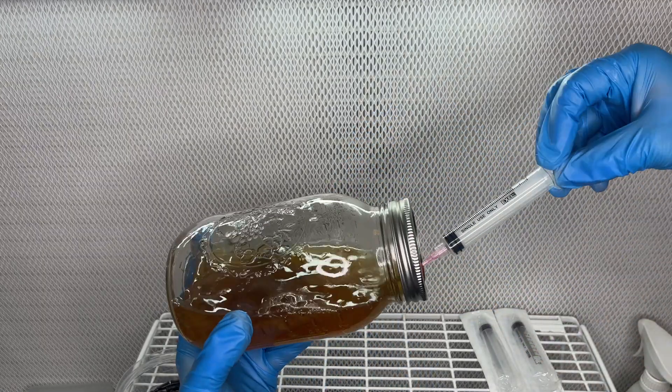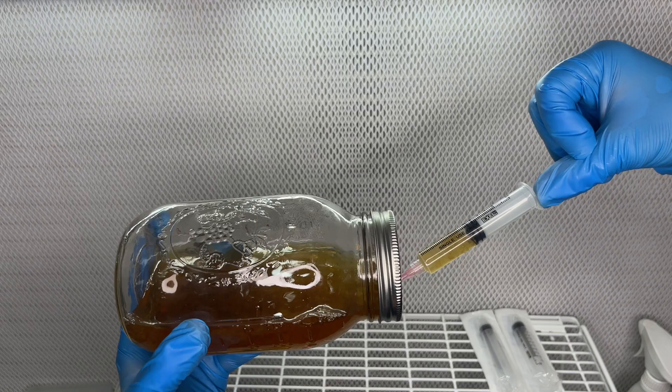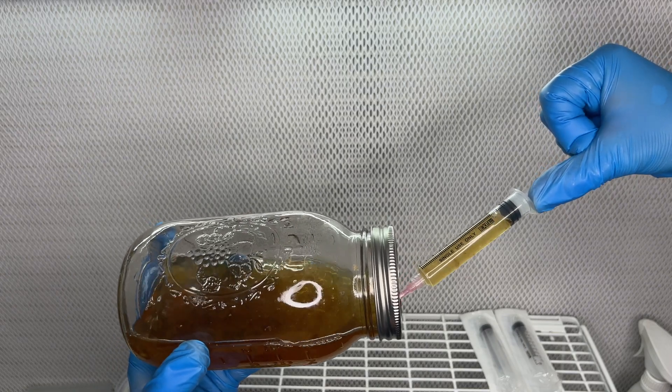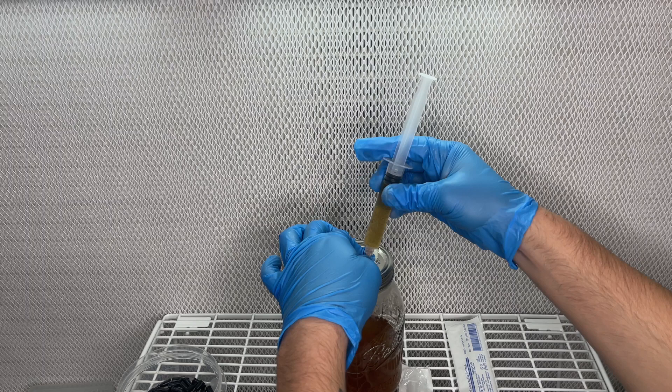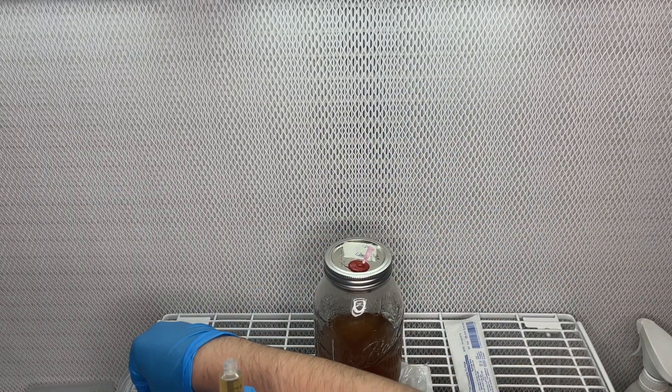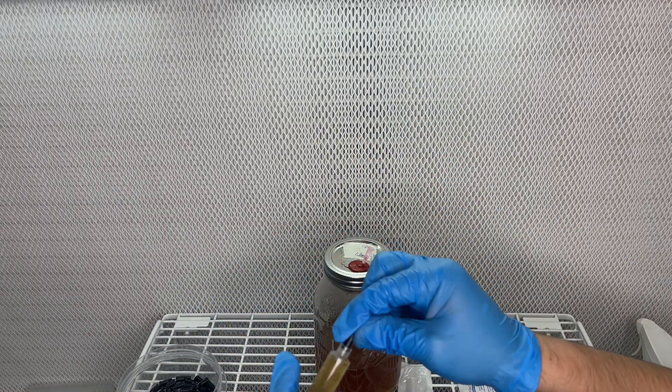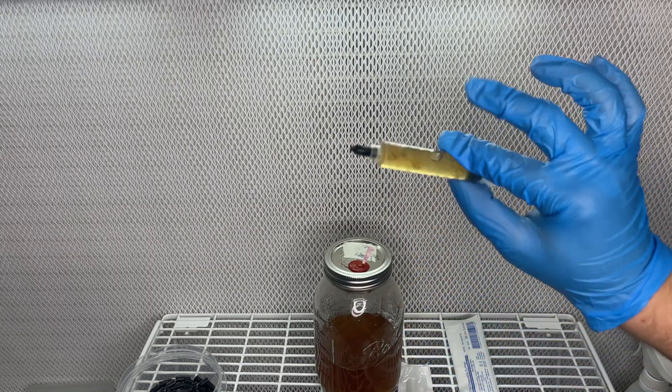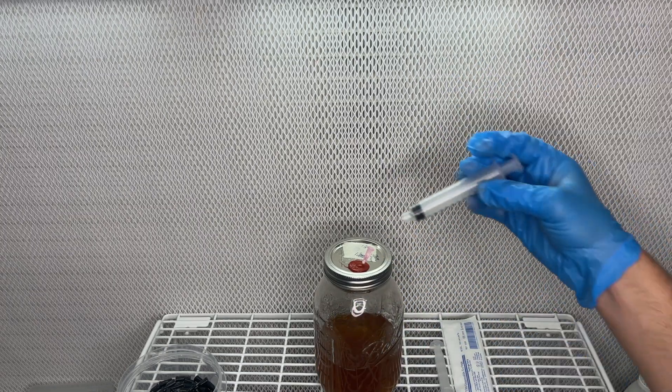After removing all of the extra liquid, you can leave the needle in the injection port and start extracting the mycelium with normal sized syringes. Now it will be much easier to make sure every syringe is almost completely full.